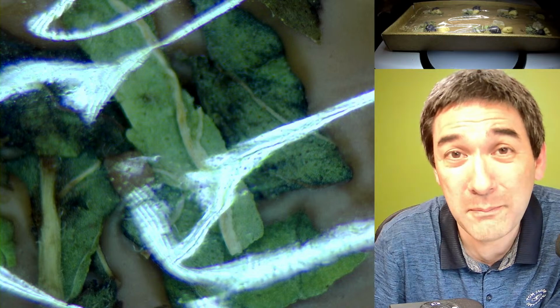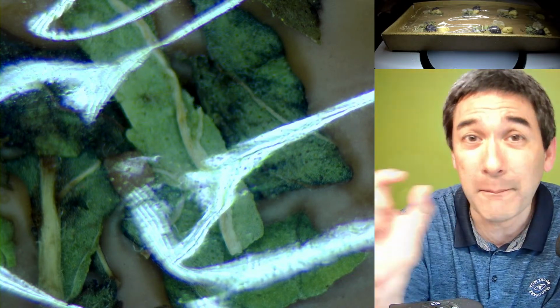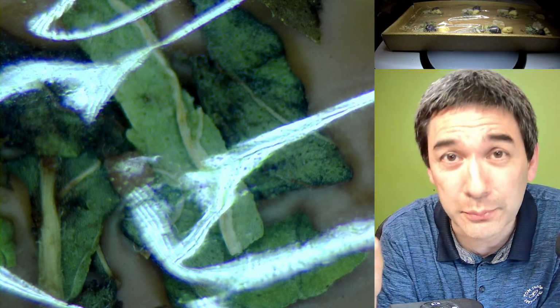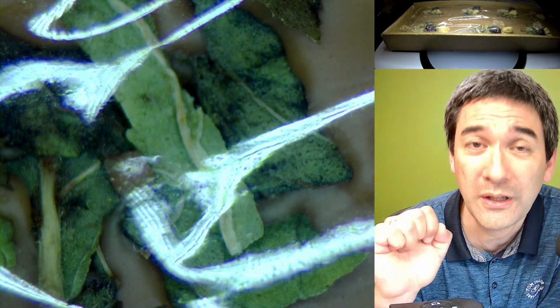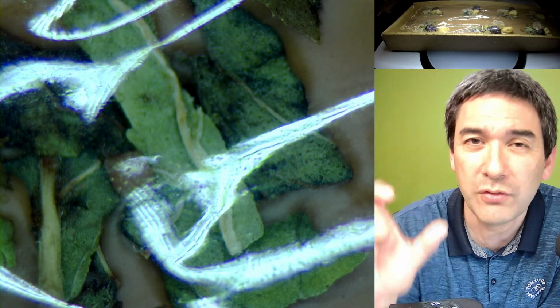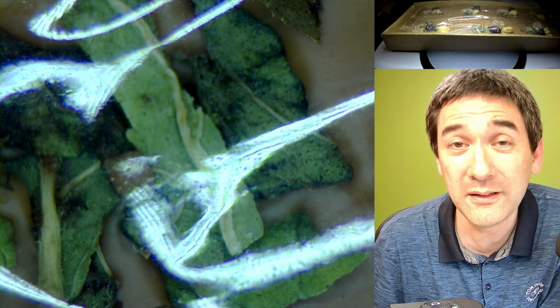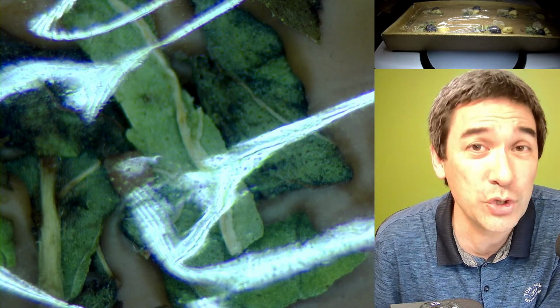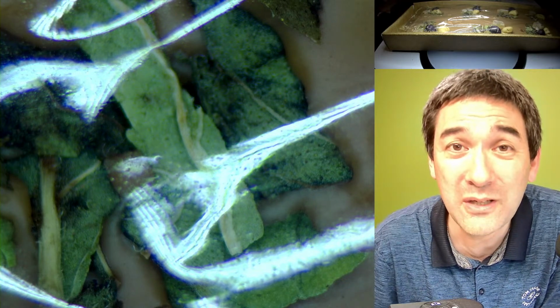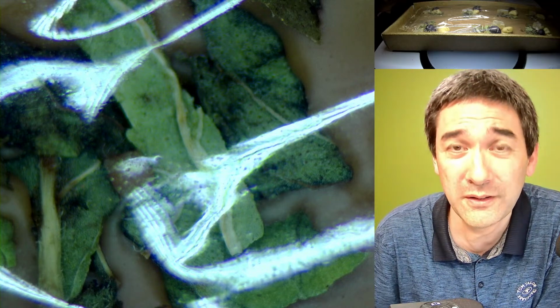Maybe even if you don't slice it, if you simply take apart the insect's different parts, then they can be easier to observe: the legs separated from the antenna, from the wings, and so on. Even if you don't make a cross section through the whole insect, just separating those parts is going to make life a lot easier. Insect preparation as such is also a science in itself. To bleach the exoskeleton, you can use potassium hydroxide or lactic acid. There are different techniques here as well.